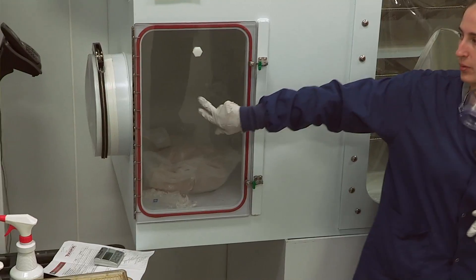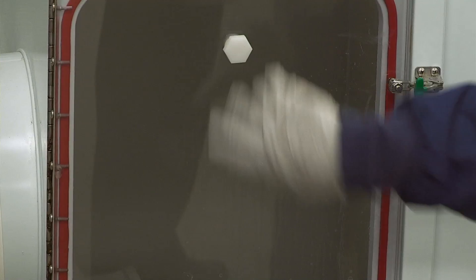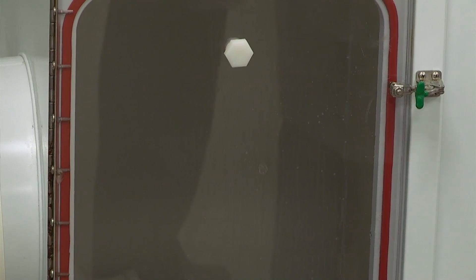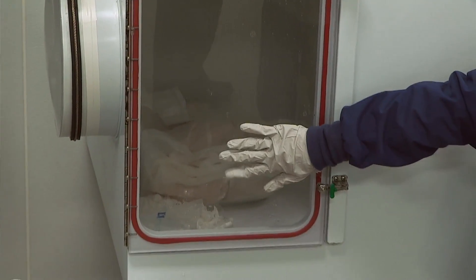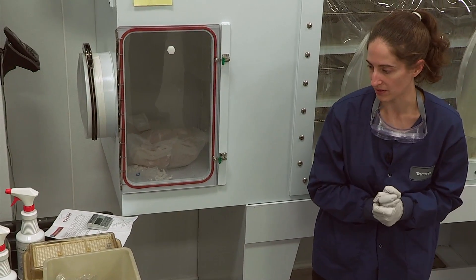On our ports we also have an adapter where if you wanted to use a spray gun, you could open this and spray through there. For germ-free projects, we have a wait time of 20 minutes for all our supplies, but for the purposes of this demonstration I'm not going to wait the full 20 minutes.